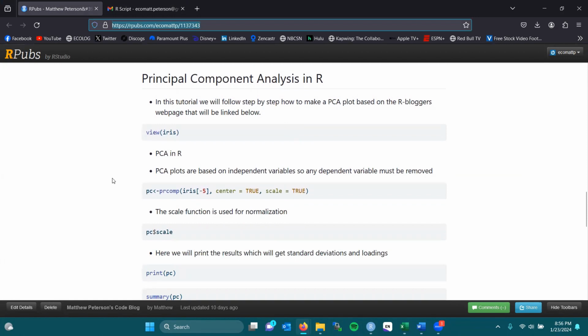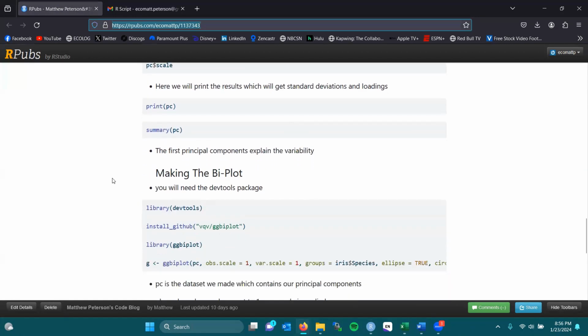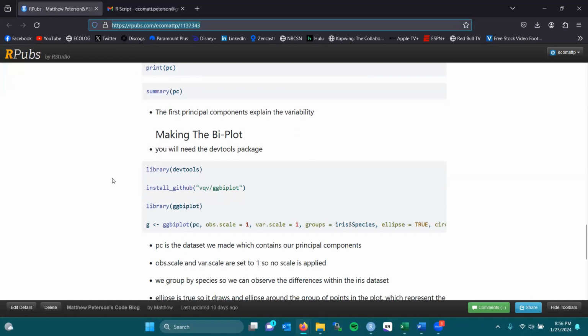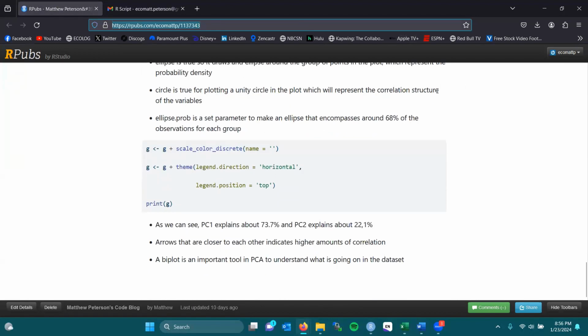I hope you find this helpful and do understand that this isn't a one-to-one with your data, but it is a strong framework to streamline your data processing through R to save yourself a lot of time if you continually create the same style of data on a day-to-day basis. Right? Hopefully that's helpful.